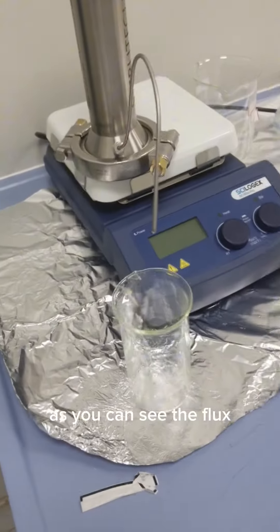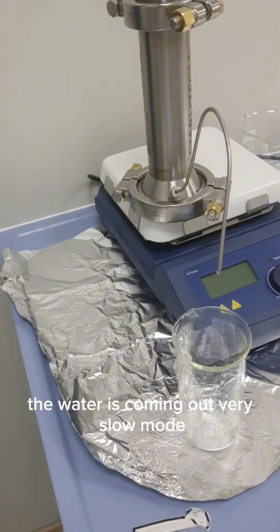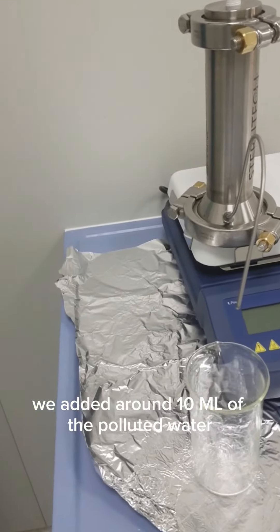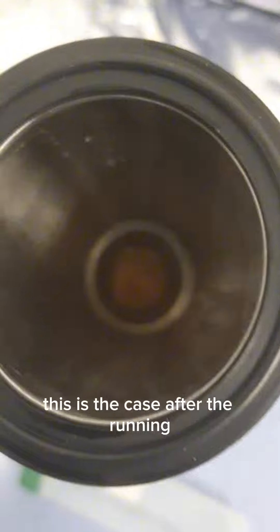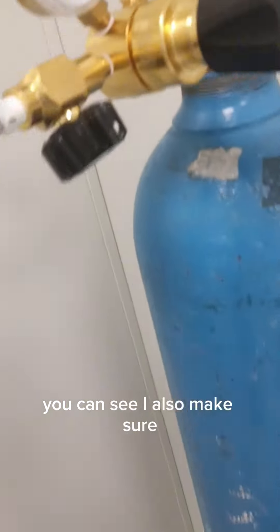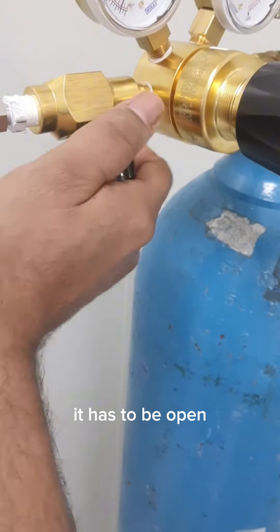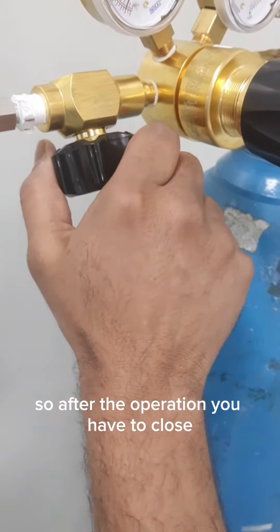As you can see, the flux — the water is coming out in very slow mode. We added around 10 ml of the polluted water. This is the case after running. Also, make sure — at the beginning I told you that in operation it has to be closed, so sorry, it has to be open. After the operation, you have to close it, so this is closed now, and then you have to release the pressure.